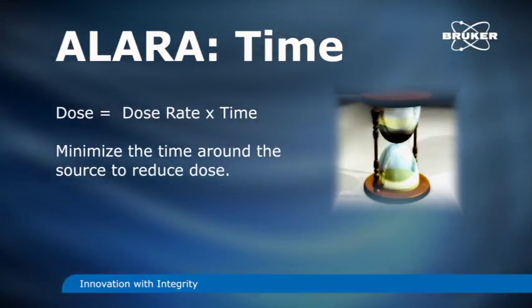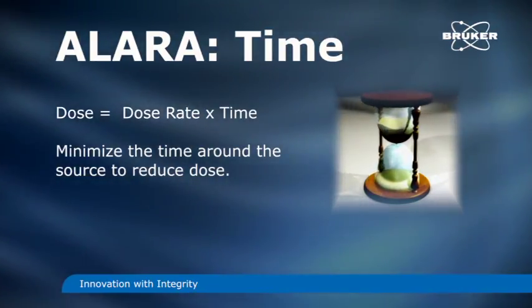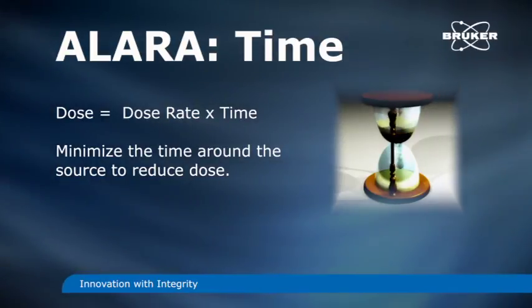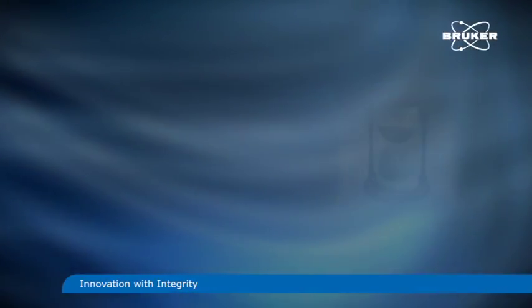To minimize the total dose you receive, limit the time you spend near the source of the radiation by planning ahead. The less time you are exposed to the source of the radiation, the smaller the dose you will receive.